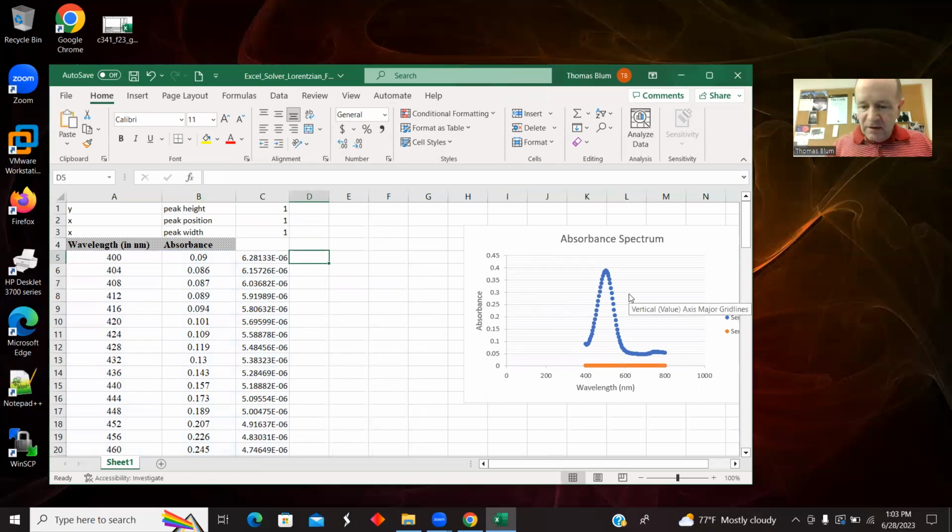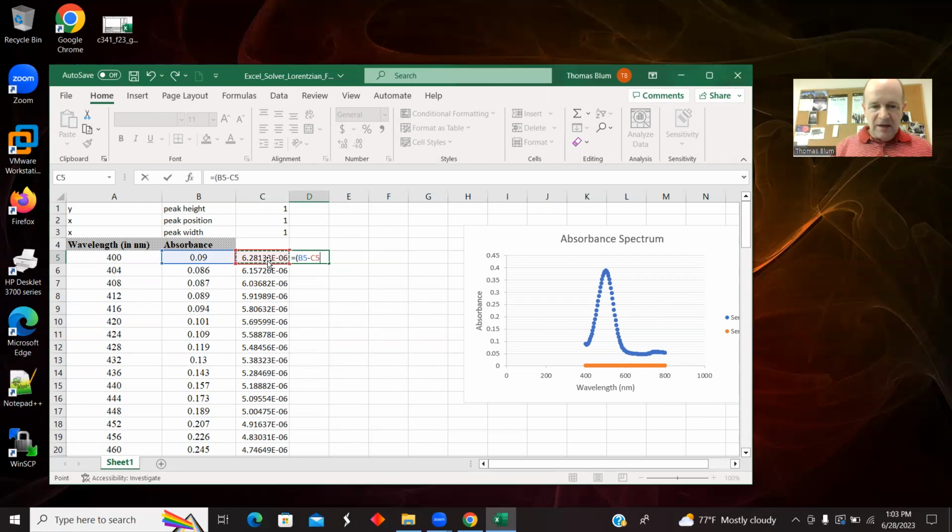And then let's try to come up with a criterion to have the computer do it. We'll start off with 1, 1, 1, really crappy, and then we'll see if it converges. If this iterative method doesn't converge, then we will come back and give it a better guess than the better guess that we just had. But we're going to make a difference between our data and the fit, and we call that an error, a deviation, a residual.